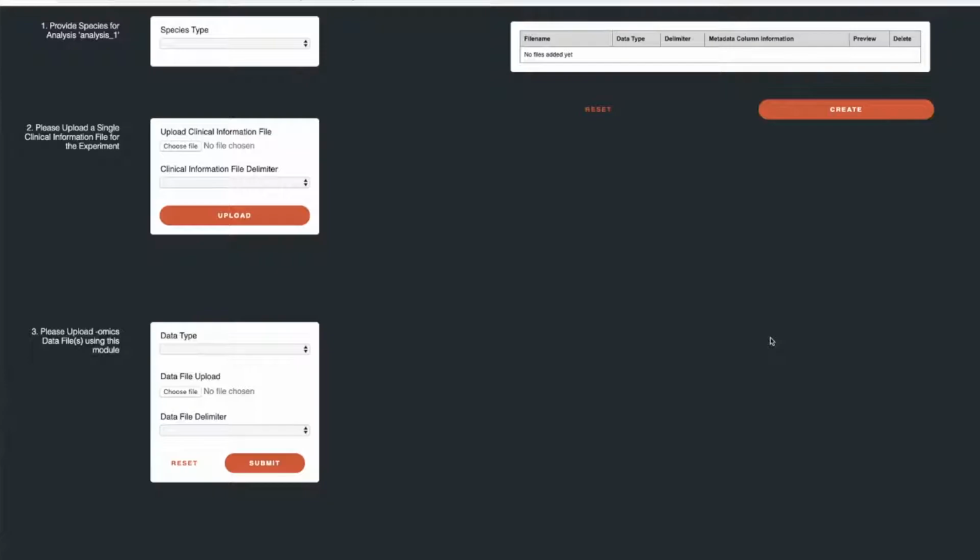In this video, we will show how to upload your own data in multiSLIDE. For this, we begin at multiSLIDE's homepage. Here, we will click Create, and in the form below, we will give the analysis a name, say Analysis 1, and then click the Create button next to the text box. This takes us to the data upload page.